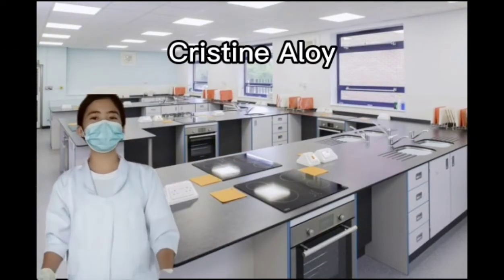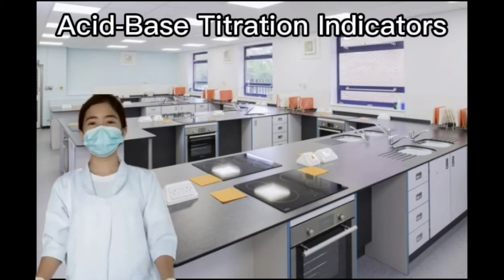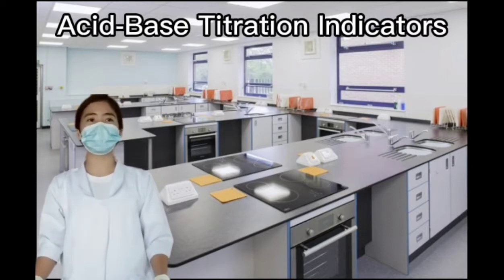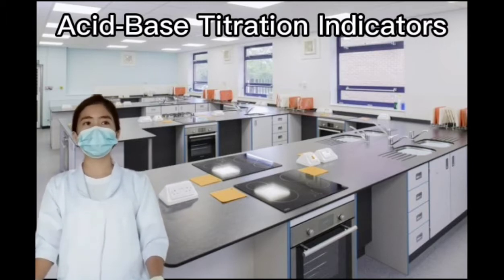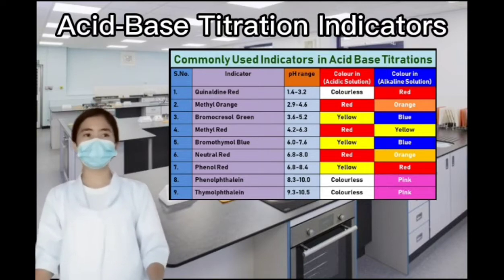Hello everyone, I am Christine Aloy and my topic is all about acid-base titration indicators. So what are indicators? It is an auxiliary substance which exhibits a color change at a particular stage of a chemical reaction. These indicators show different colors at various pH levels, so we can easily determine the endpoint.